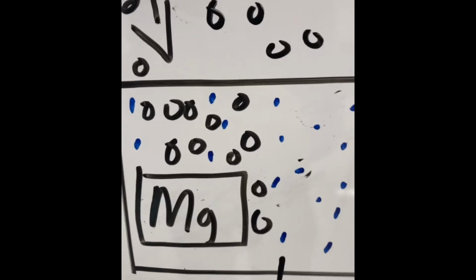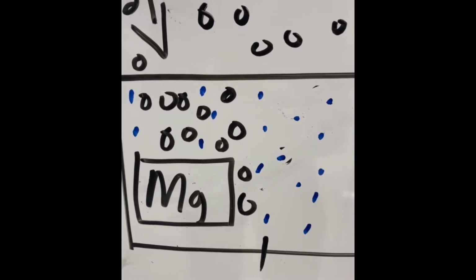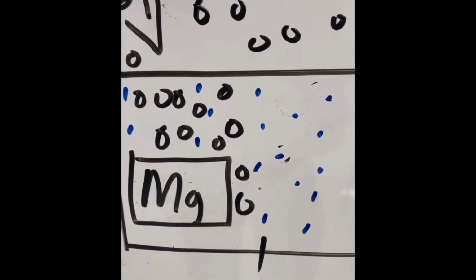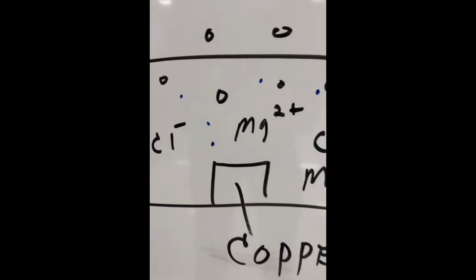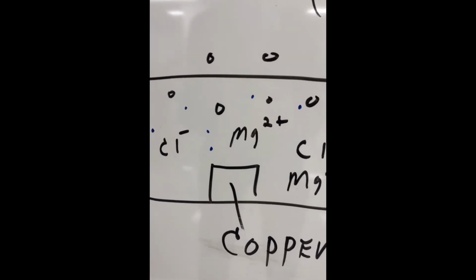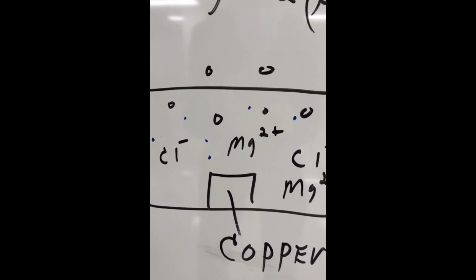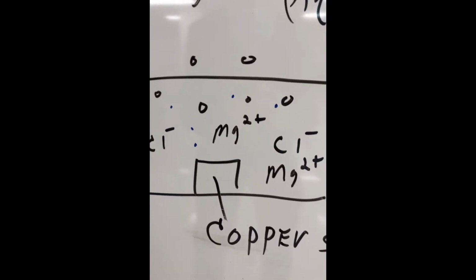Notice we're going to see bubbles produced. Those bubbles produced are hydrogen gas bubbles. So we're actually getting two reactions competing here at the same time. Over time, notice the copper now has been reduced to copper metal. Notice the color has changed. We have very little copper double positive blue ions present. Notice we have spectator ions present, lots of water, and we have solid copper.